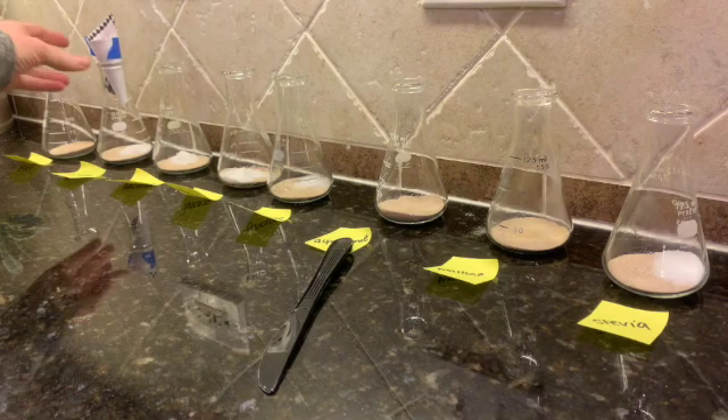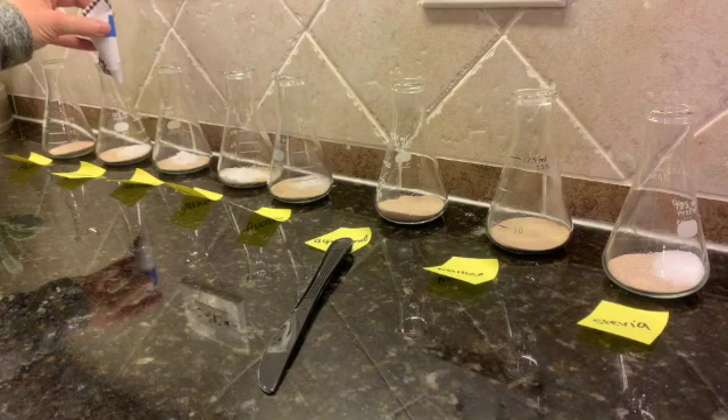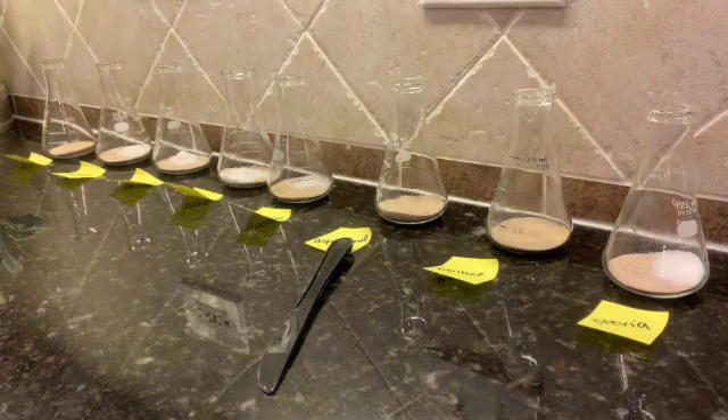You can kind of see in this last one here, I have a little makeshift funnel. Each one of these had their own funnel so that we didn't cross-contaminate. The next thing I'm going to do now is add half a cup of warm water. The first fleeker is only going to contain the yeast and the water — it will not have any sugar or any type of carbohydrate added to it.